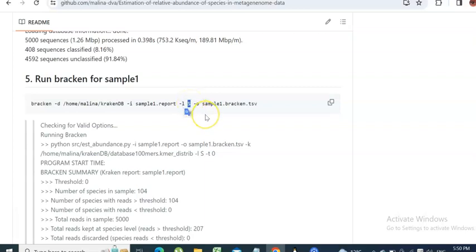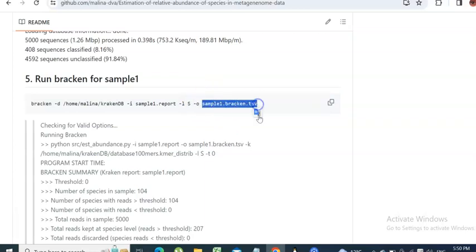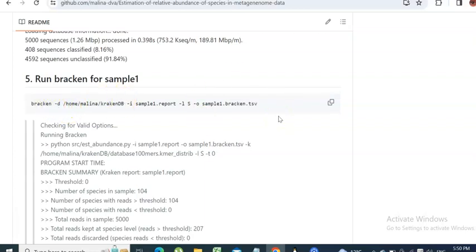You can specify genus with G, class with C, and so on. The output is the name of the table we obtain from running Bracken, which estimates relative abundance for this particular sample. We are again working with sample one.